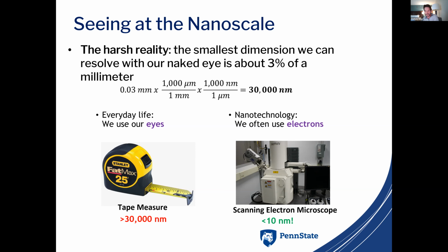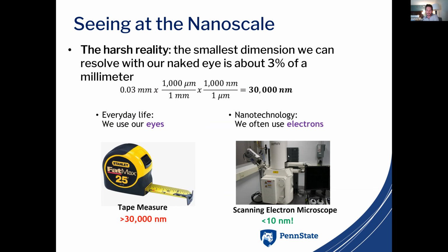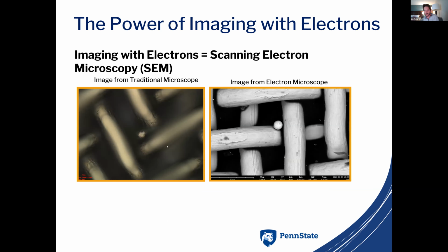Most universities don't even have one of these things because they are extremely expensive. And that's the value of the RAIN network: these things are available to use for student education free of charge. Basically, through a resource sharing model, you can send samples to one of these universities, to someone like Lauren, and she can pop your sample into one of these high-powered machines and get these images to do nanotechnology education.